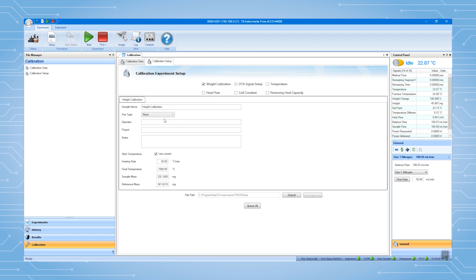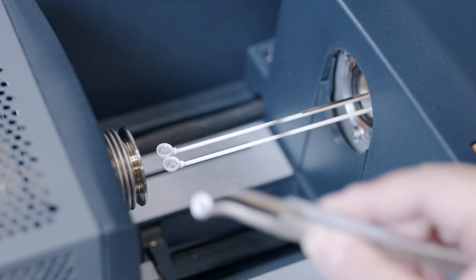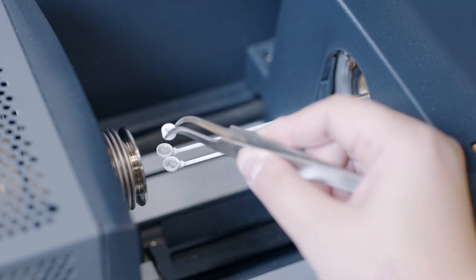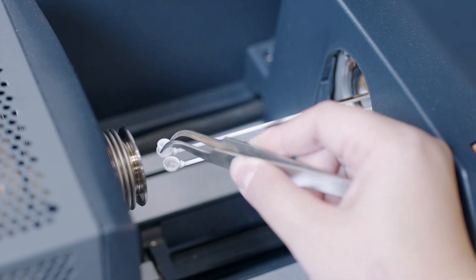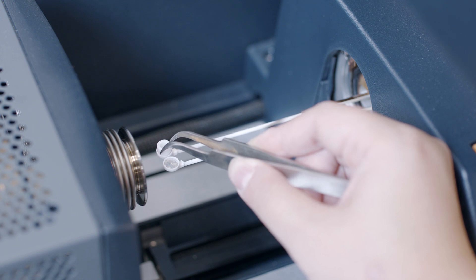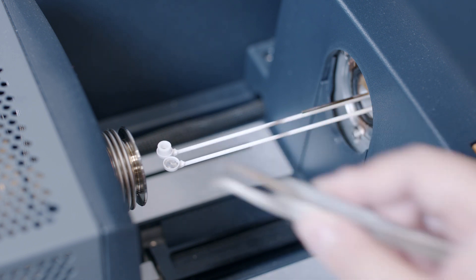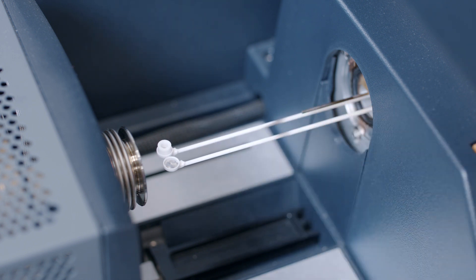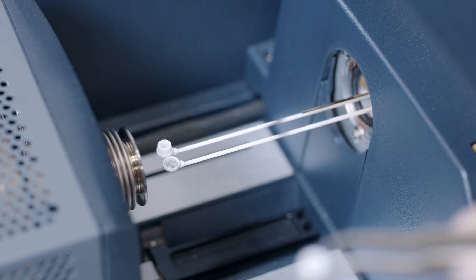For units without an auto-sampler, at the end of the first run, you will need to manually put the two weights on the beams and start the second run.